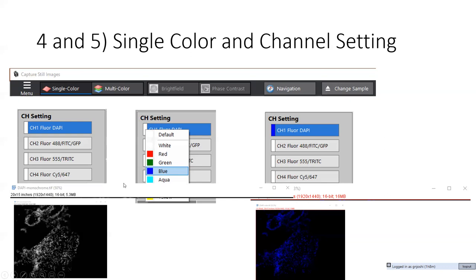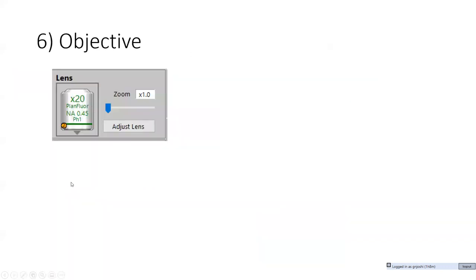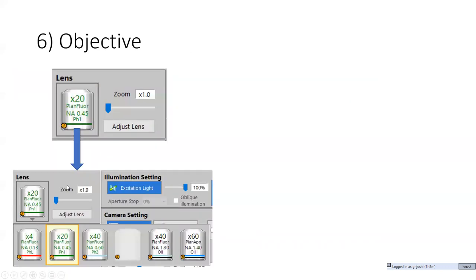So I would say if you want to visualize or see really quick on screen how the merge of different colors looks, by all means, go and use the colors over here. But when it comes to acquisition, I would strongly avoid acquiring the images in color, and I would only acquire images in monochrome, okay?